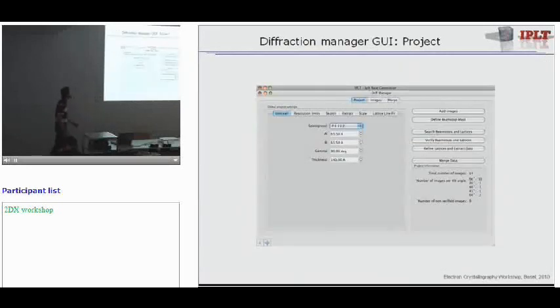Okay, so IPLT has a graphical user interface you can use for the basic processing. In parallel, there is also a command line interface if you want to go into more details, try things out, want to have tighter control on what you do. So this gives you really the high level overview and gives you the easy processing. But still, depending on the project, chances are good that not everything works automatically. So you have to check it and then go more to the command line interface and have a look at the steps in detail.